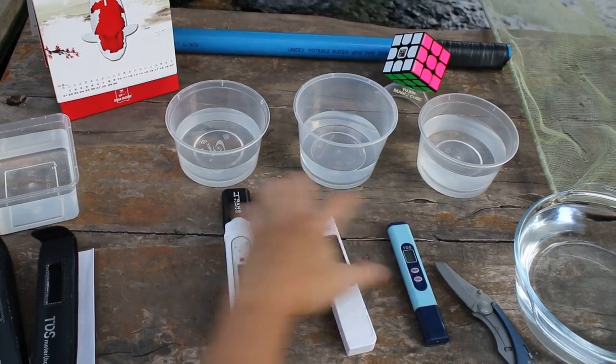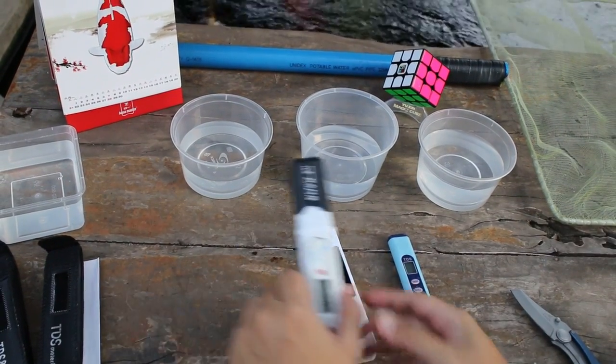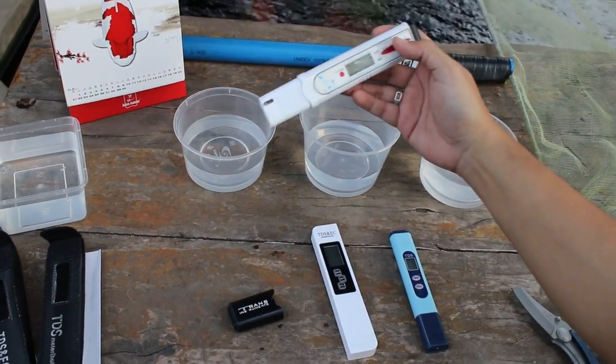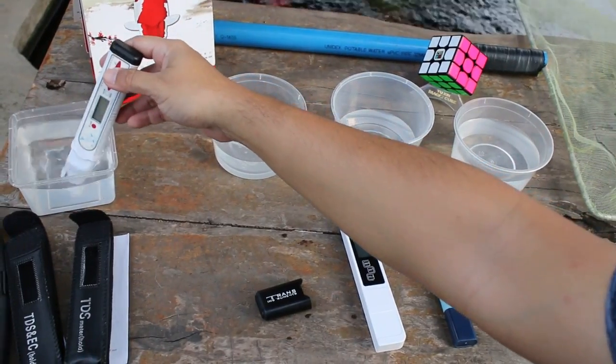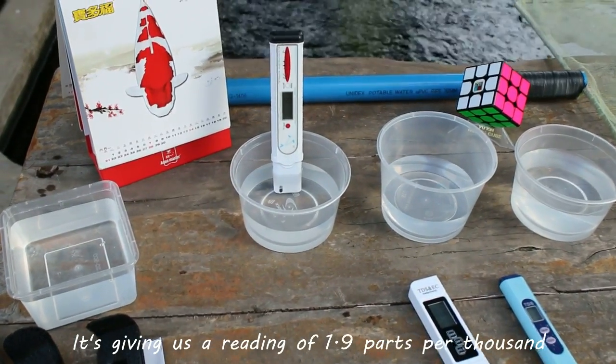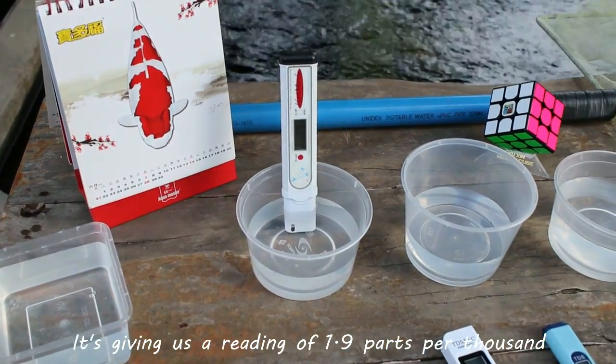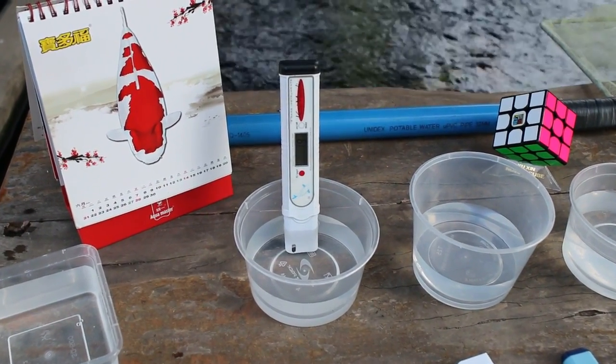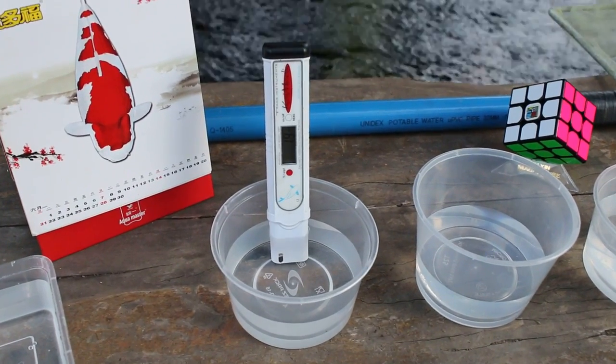We'll try first with the coin medic. We'll do a washing first. It's giving us a reading of 1.9 parts per thousand. I've set it to parts per thousand a while back, so there's your reading on our first unit.